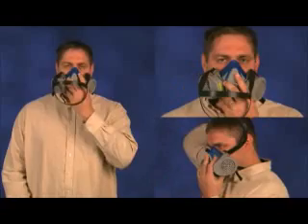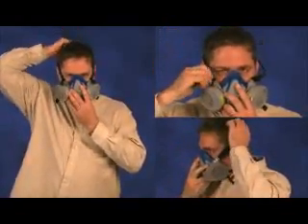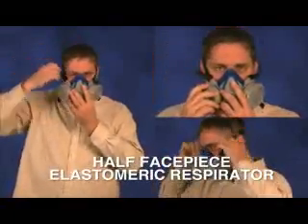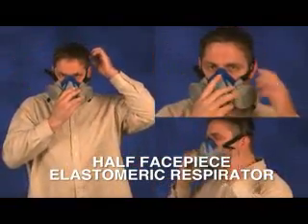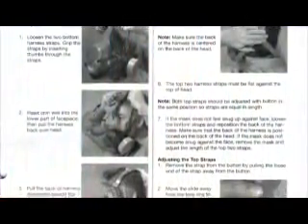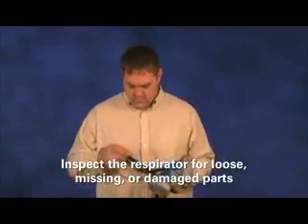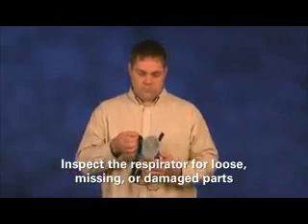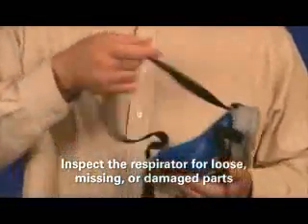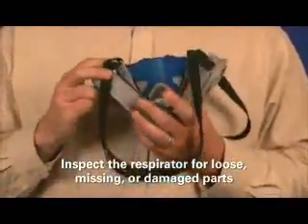Now let's explore the general instructions for properly donning and doffing and properly conducting a user seal check for a half facepiece elastomeric respirator, sometimes referred to as a half mask. Remember, these are just general instructions. You should always follow the manufacturer's instructions for the specific respirator model that you are using. To begin, inspect the respirator, including the straps, valves, and gaskets, for loose, missing, or damaged parts. If you find any damage to the respirator, repair or replace it.